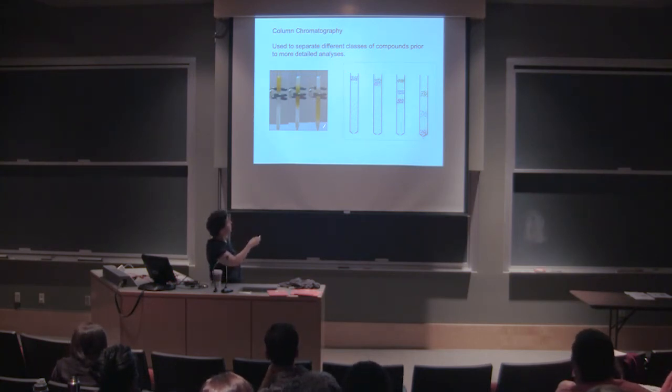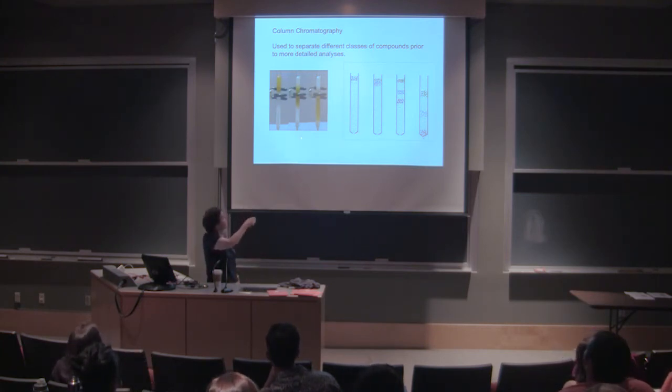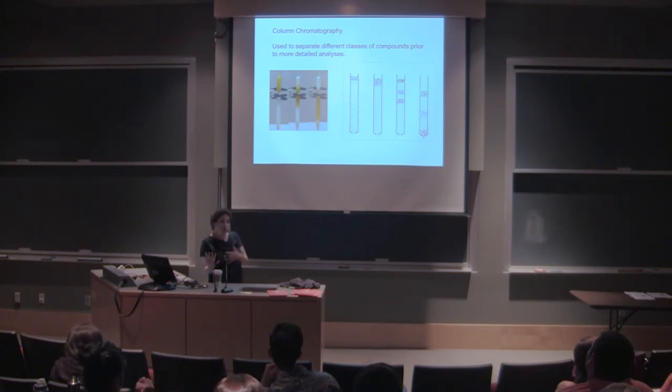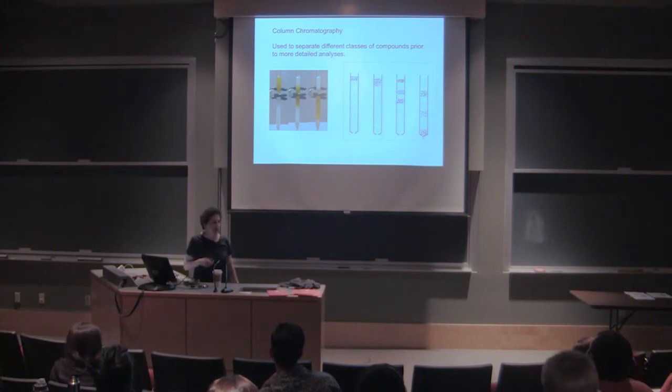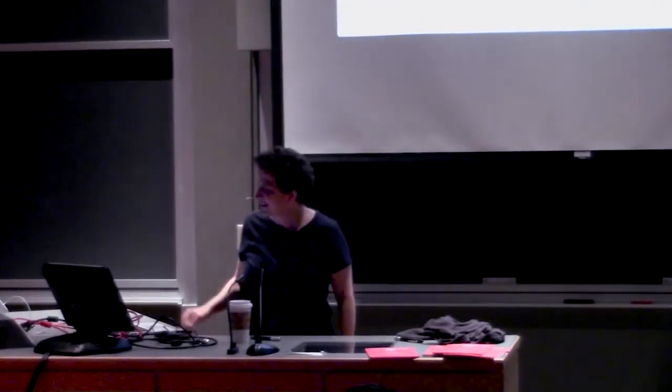In the lab, you might have done work like this, where you introduce a mixture and you can sort of watch it flow through. This is a cartoon illustration of that. It's the same principle. We have, in this case, a movement of liquid through, and then a stationary phase is some kind of silica gel or alumina of some kind, where our molecules are interacting and deciding, do they want to move or do they want to stay put, right? And so you encourage them gradually to change how they feel about that, so that you kind of separate one compound from another. Not to anthropomorphize chromatography, but that's kind of how I think about it. I'm like, come on, you can do it.